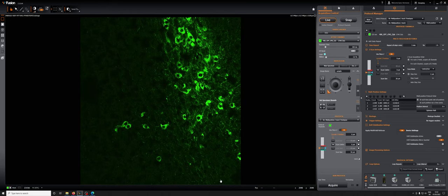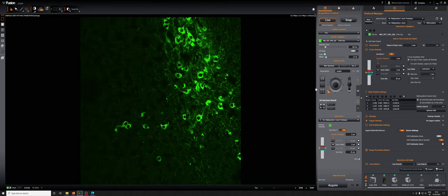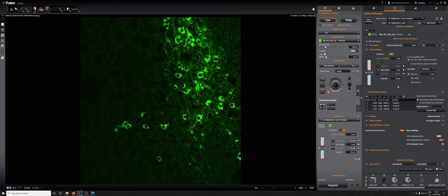This apply multi-field refocus is one of the first things you need to turn on. This is all, again, in these instructions which live on the desktop of this computer, and they will also physically be in this room.